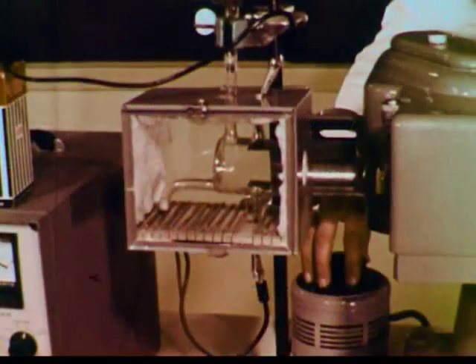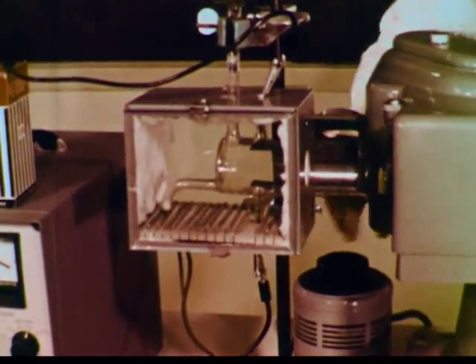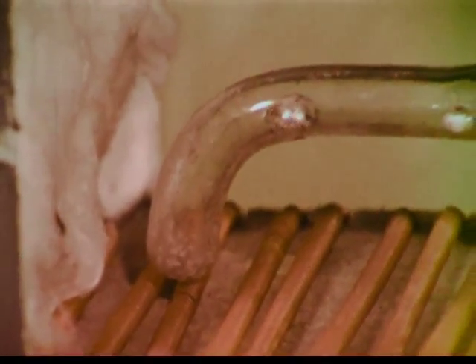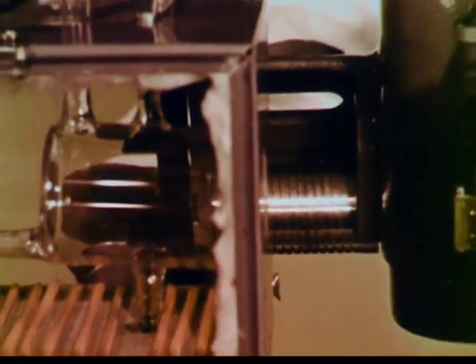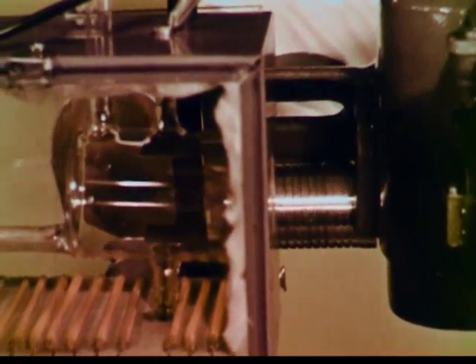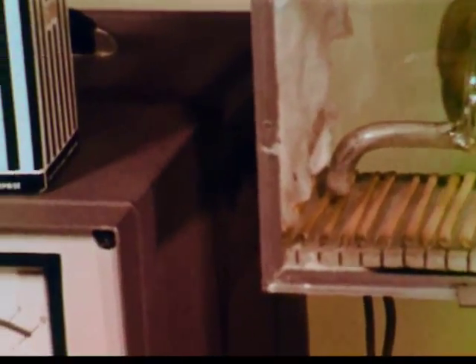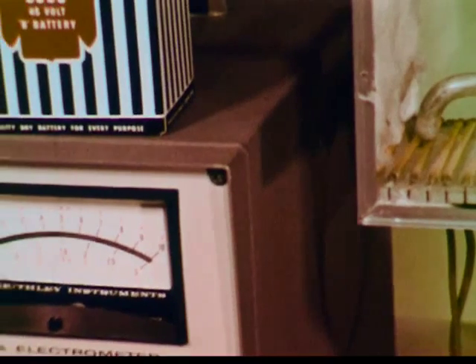Now we have a good vacuum, so we'll turn on the oven and heat the cell. As soon as the sodium starts to vaporize, we will seal off the cell. The sodium melts, and when it strikes the hot glass, it boils. Light of a known energy shines through the oven and cell windows and into the gas. We'll begin with low energy red light. Watch the meter while we slowly increase the frequency of light entering the sample.